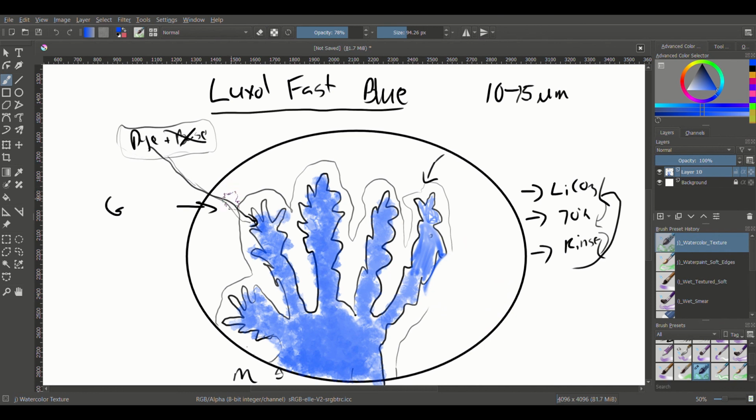So yeah, that's Luxol fast blue. It's fairly simple. You just have to make sure that you're paying attention to differentiation and don't over-differentiate, especially if your docs are trying to find those myelin sheaths. You might be looking for a degradation of myelin sheaths, so you don't want to make an artificial degradation when there is still myelin sheath there. But as far as your control goes, once the gray matter goes translucent, then you're done, because you want to make sure that you're keeping as much myelinated tissue as possible.